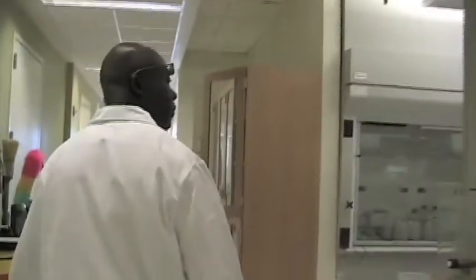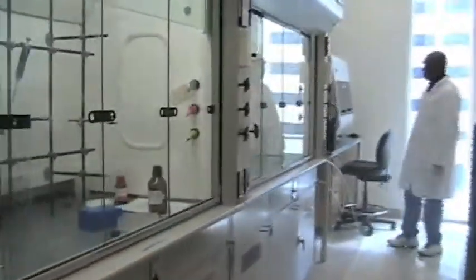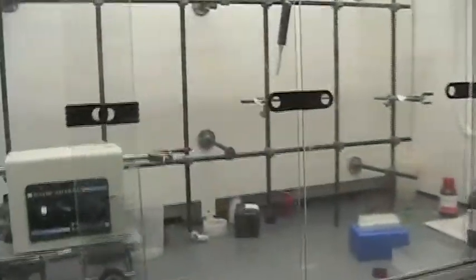So this is the entrance to the lab. We're going to go up and down the aisles and look inside some of the fume hoods and look at some of our equipment. So these are the fume hoods, and this is where we carry out experiments. This is called a rotovap in this hood, and in the other hoods we just have some chemicals.